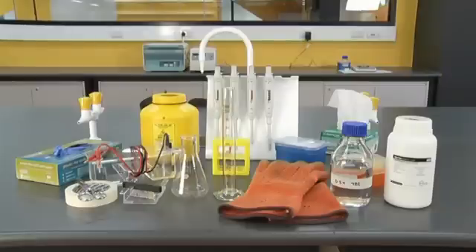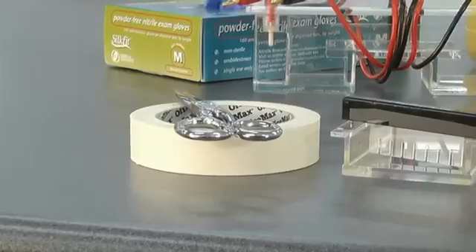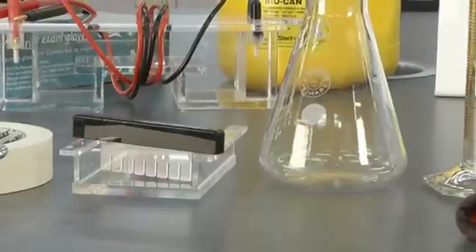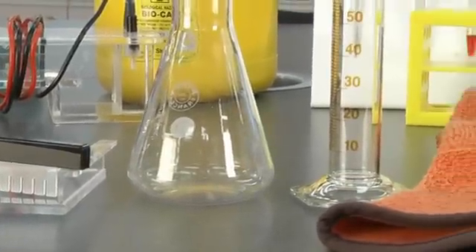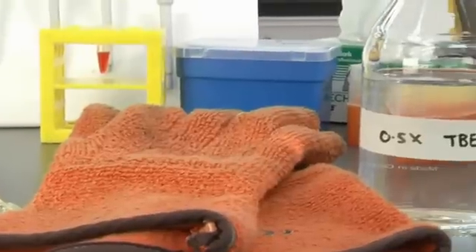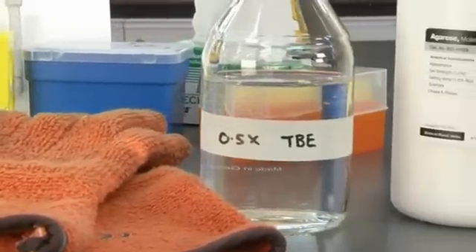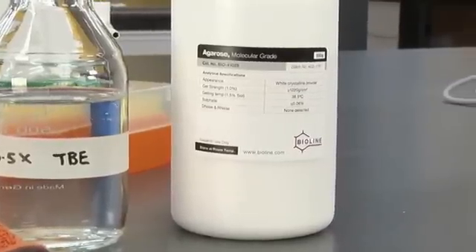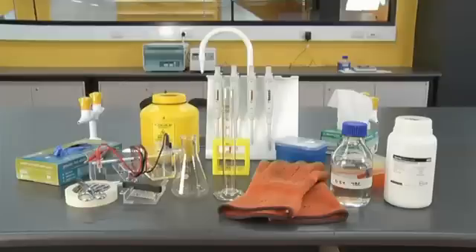To cast an agarose gel you will need tape, a casting tray and gel comb, a conical flask, a measuring cylinder, heat proof gloves, gel running buffer, and molecular grade agarose. Do not confuse agarose with agar, which is used to prepare culture plates. Depending on your protocol you may also need a fluorescent intercalating dye.